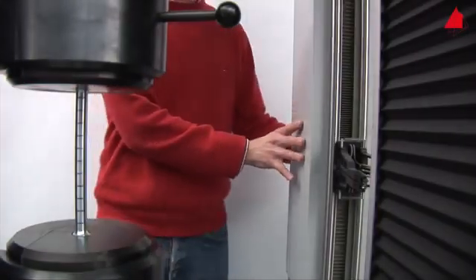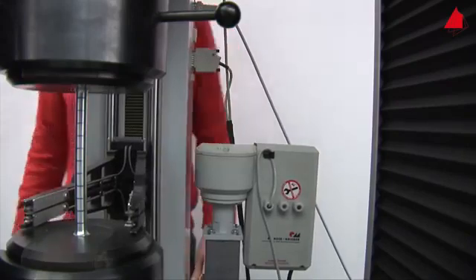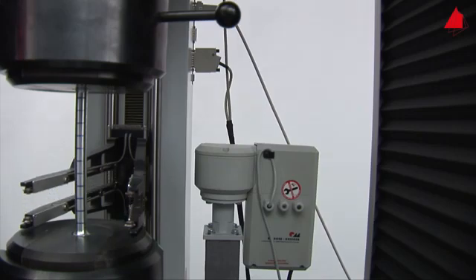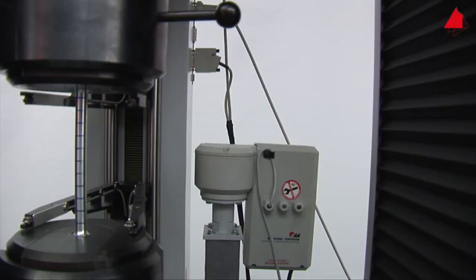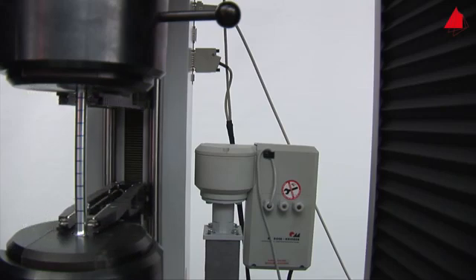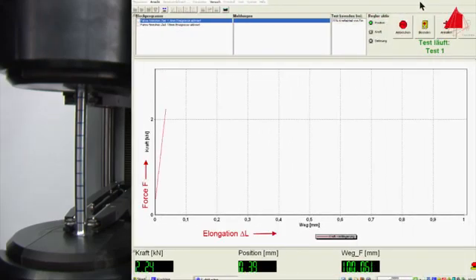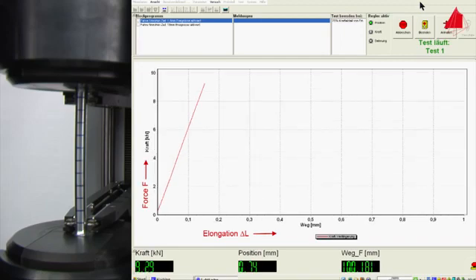After fitting the test piece into the testing machine and panning the extensometer into its working position, the test can start. The initial linear curve in the force-elongation diagram again shows the elastic behavior of the material.